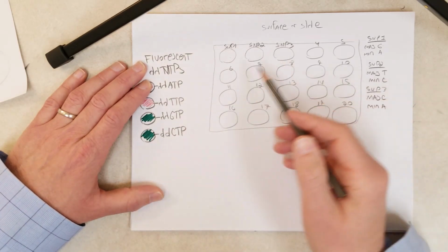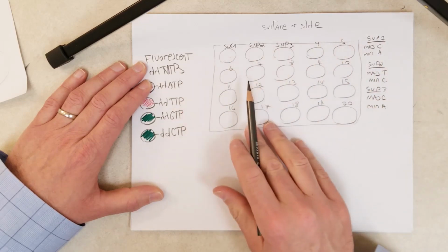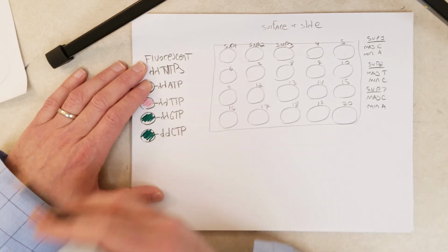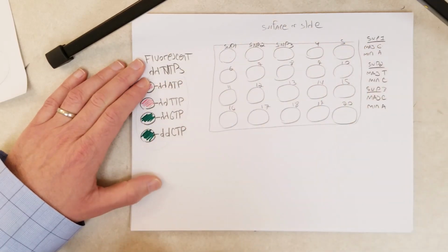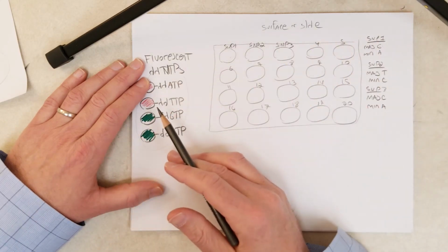Okay, so now this slide right here, these B's represent John's DNA. So we added John's sheared single-stranded genomic DNA. It annealed to the SDOs. We added the polymerase. We added the ddNTPs. Okay, now there's red and green everywhere. If we were to shine a laser on it, we'd see red and green everywhere.